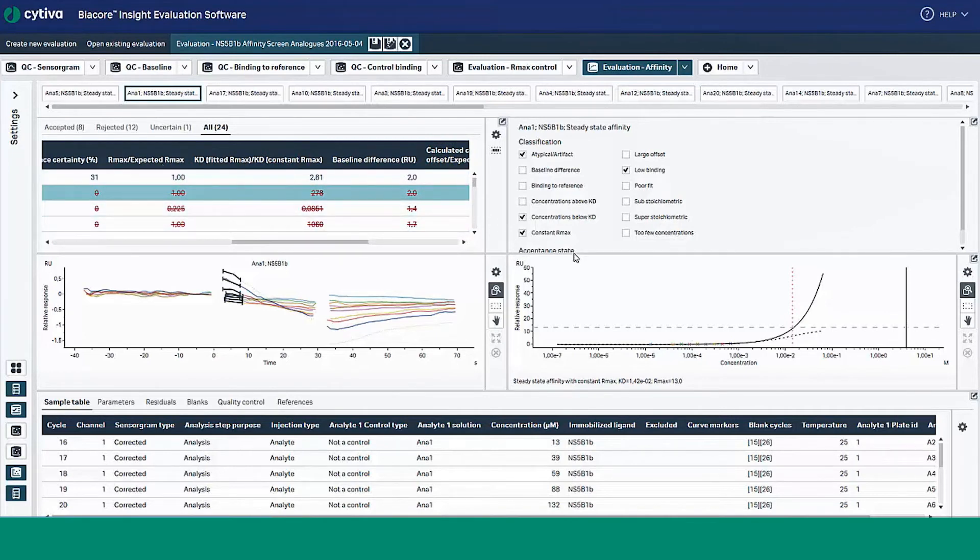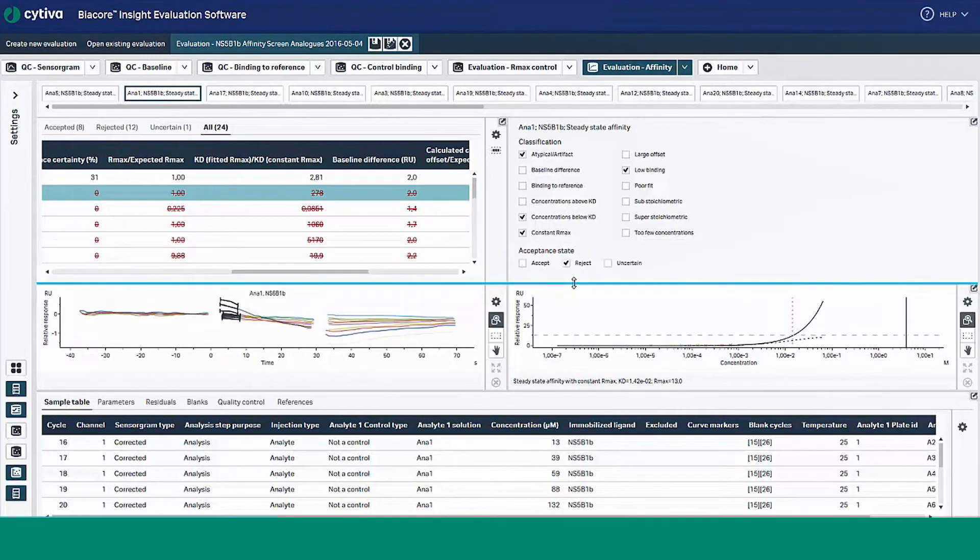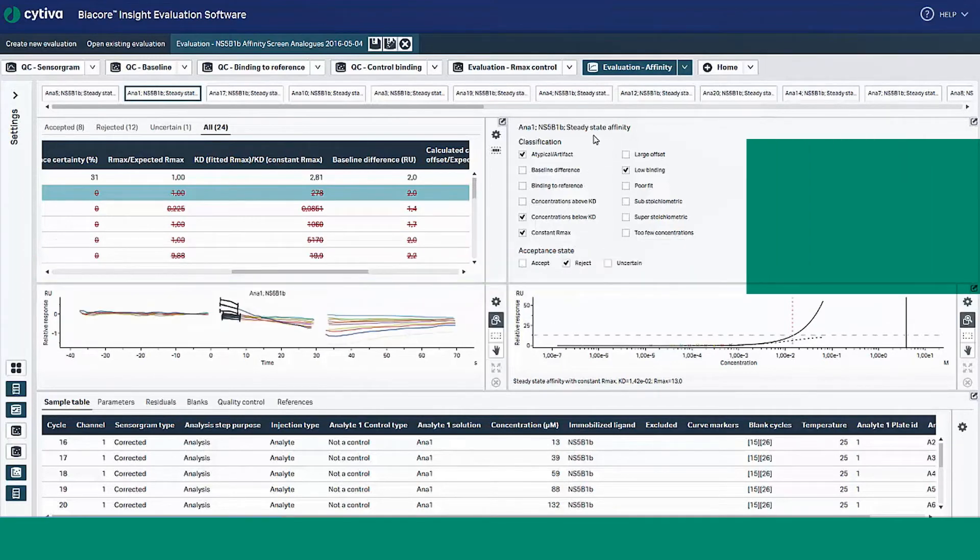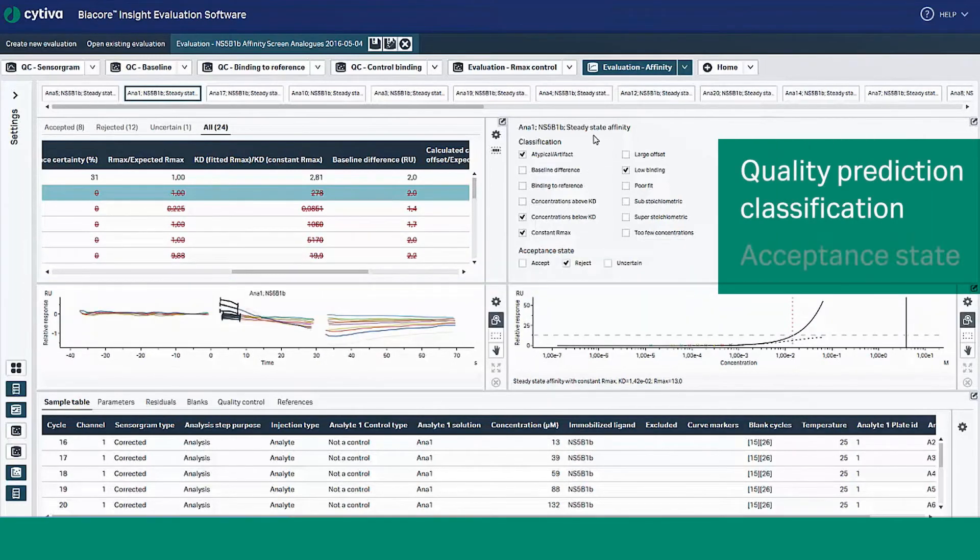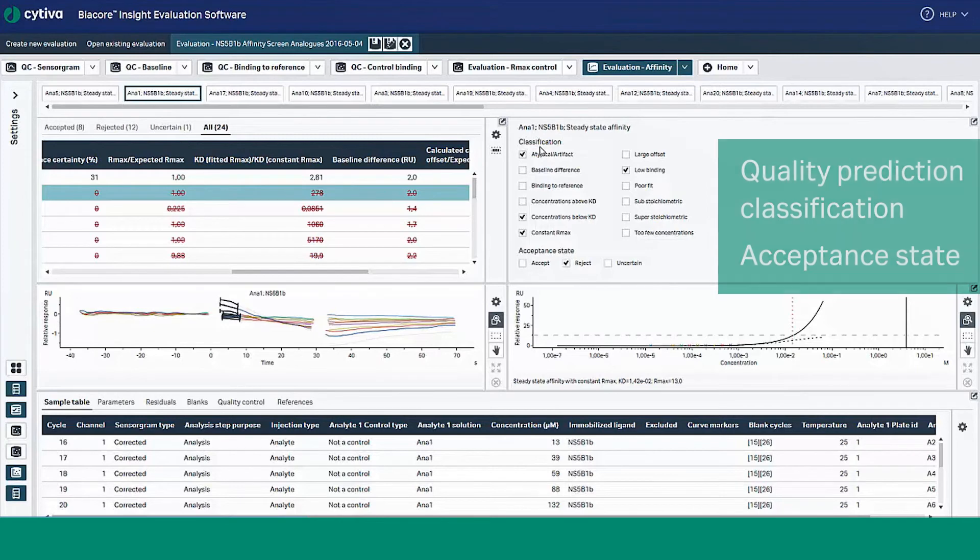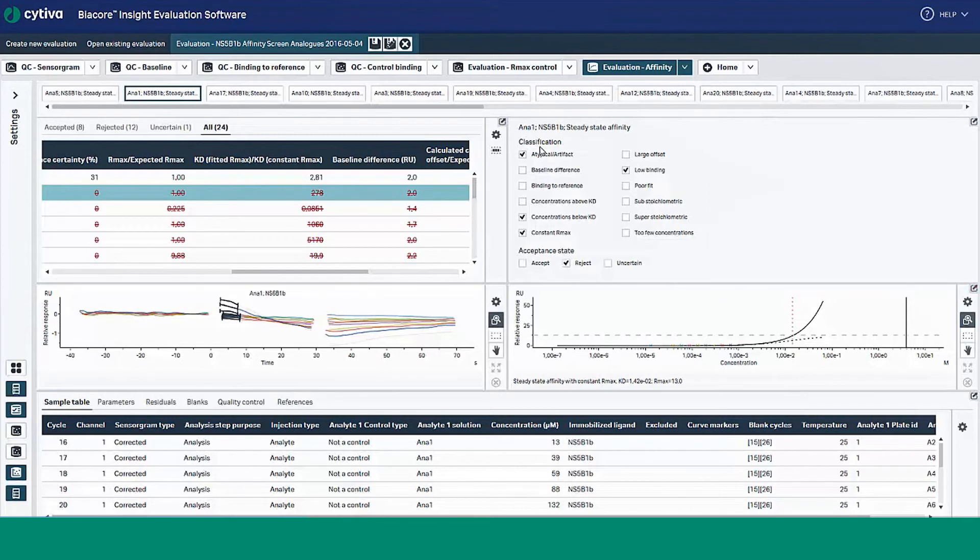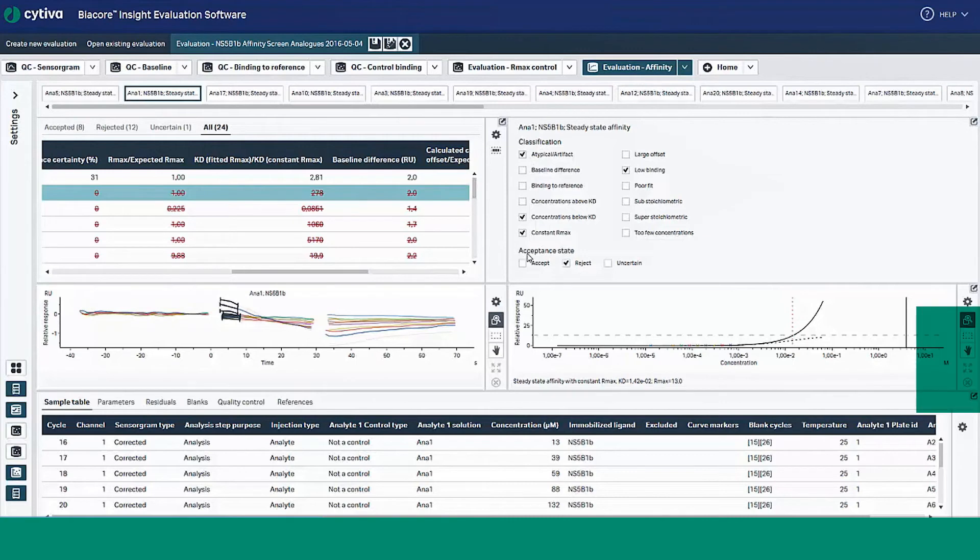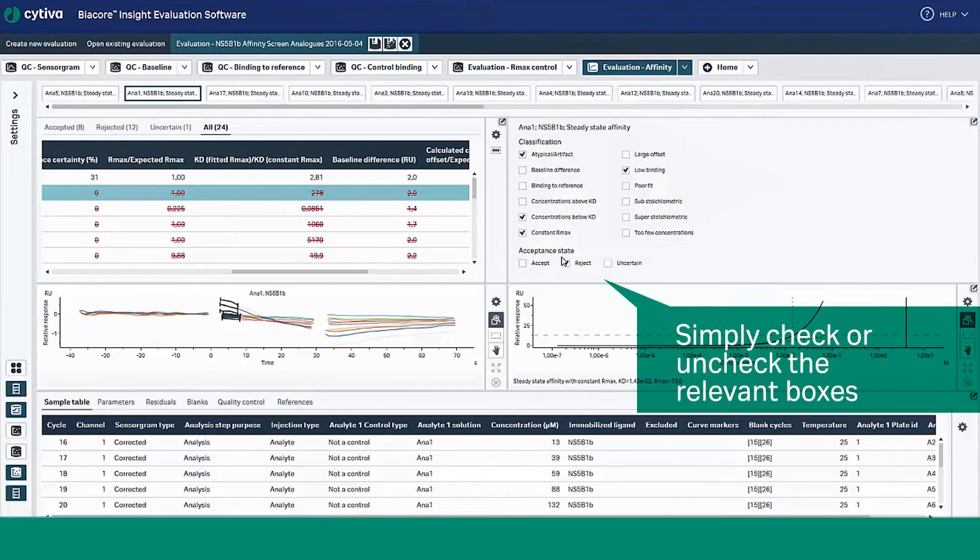Look on the right hand side to find the classifications manager. This contains the quality prediction classifications and the acceptance state. Just like the binding level screen functionality, you can override the prediction classification and acceptance state to replace it with your own interpretations. Just check and uncheck the relevant boxes.